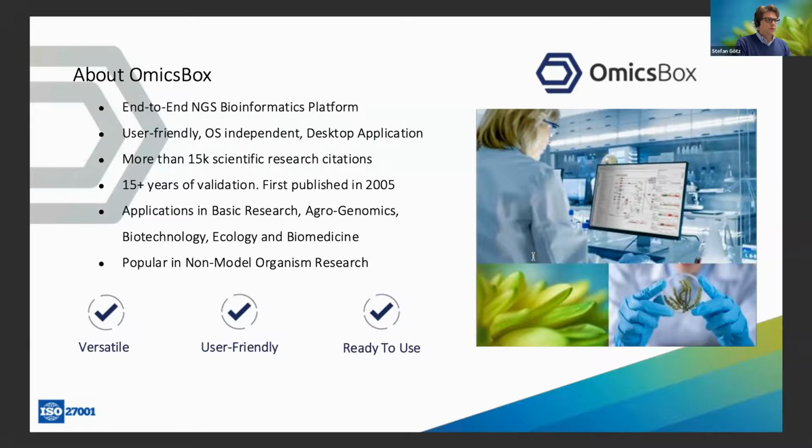OmicsBox is a user-friendly, operating system independent desktop application. So it's actually installed on your computer, but then operates on a cloud backend. All the big number crunching, computationally heavy algorithms are offloaded into the cloud, so you don't get issues on your local system.